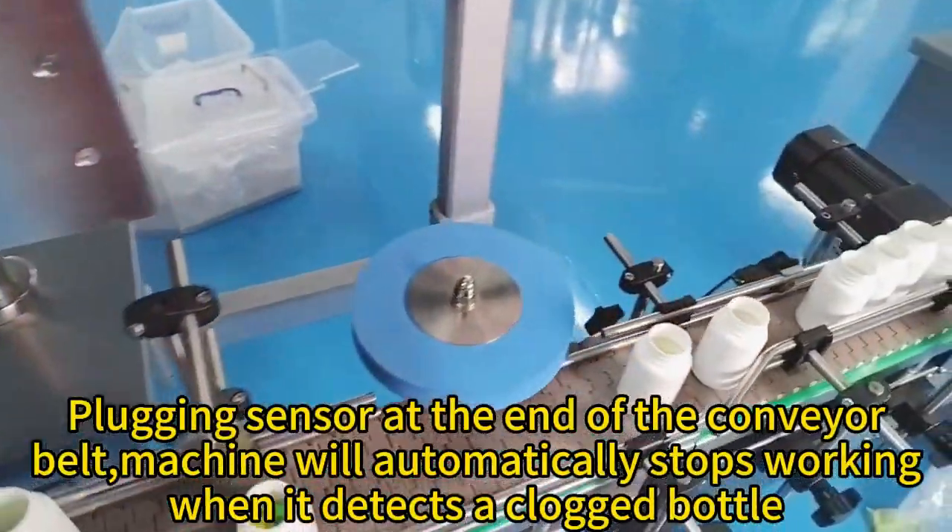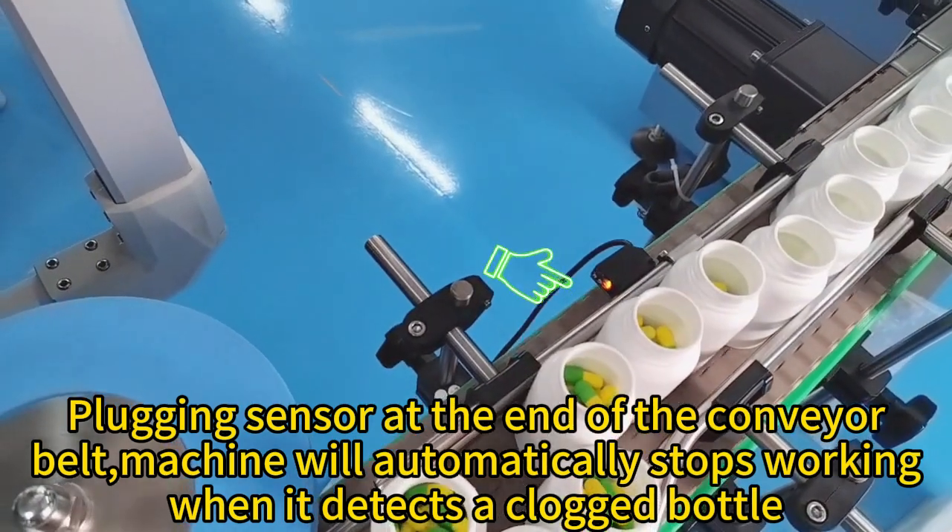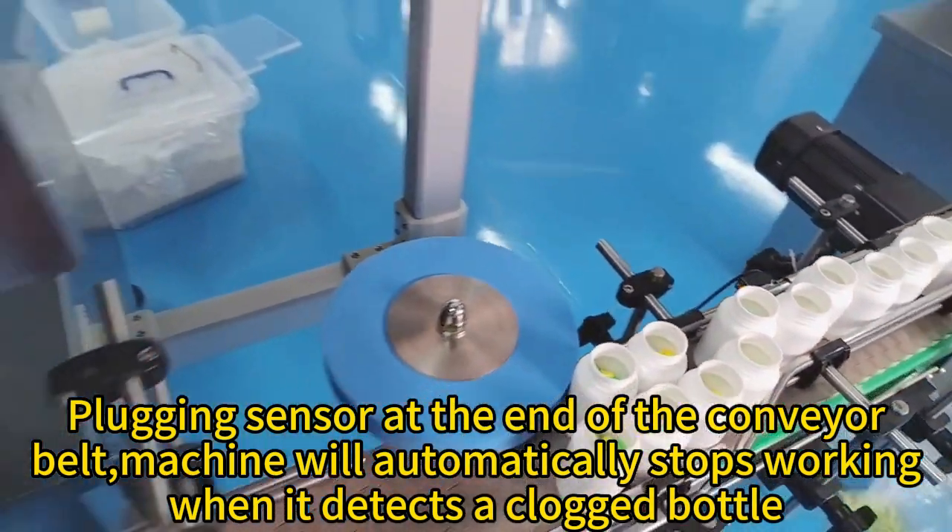Plug-in sensor at the end of the conveyor belt. The machine will automatically stop working when it detects a clogged bottle.